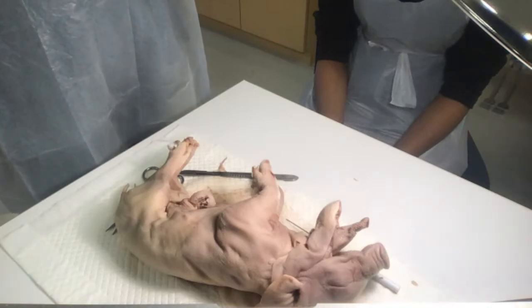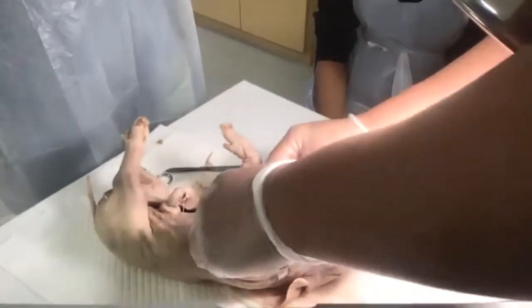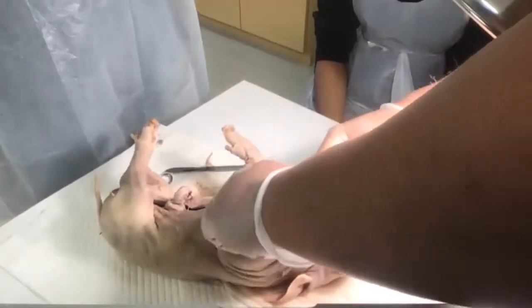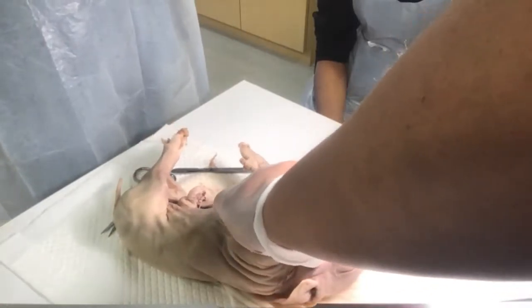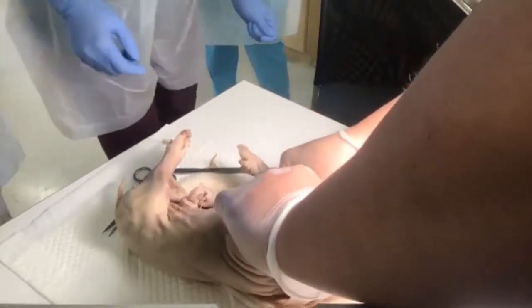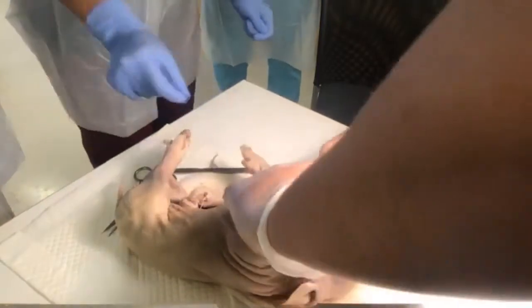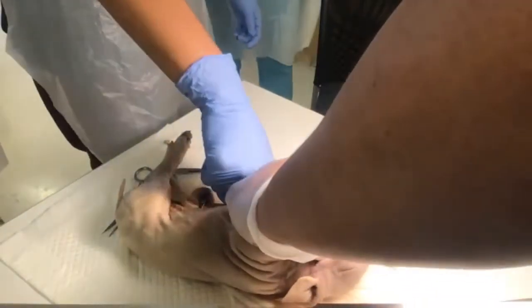All right, who's going to be surgeon next? The next part, going to open up this part. And who's going to be surgeon? Who's next? Aren't you next? So I want you to open this up. And see this, feel this, this knot right here. Don't be afraid, the pig's already dead. Well, it never was alive to begin with.